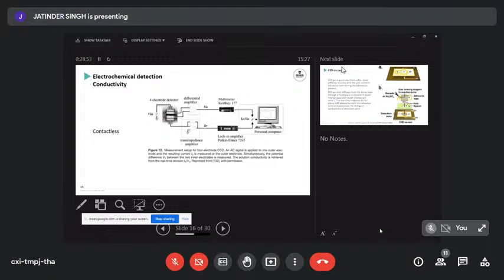I then put some photosensitive material on there to make sure the floor was even, with some holes in there where the electrodes were, so that the electrodes wouldn't be sticking out anymore. Then I put another layer of photoresist on where I made a channel in, and put a third layer on top to seal the channel.